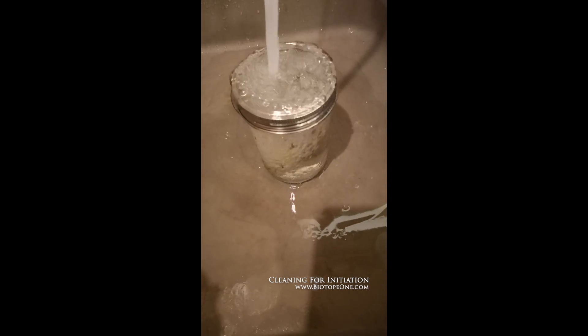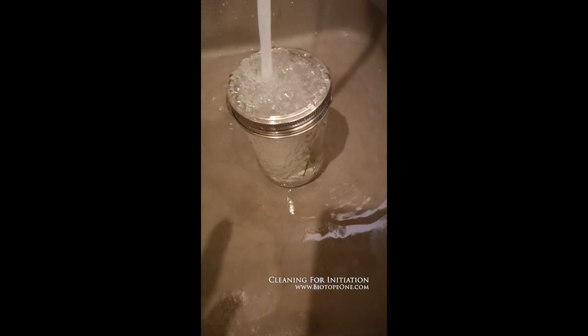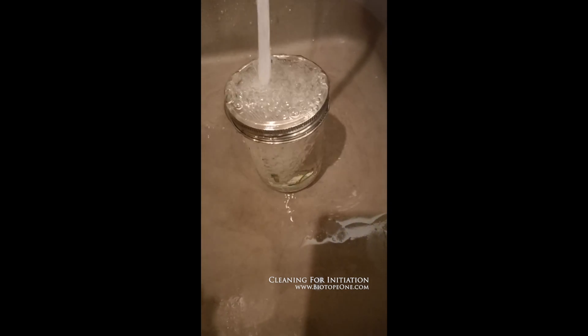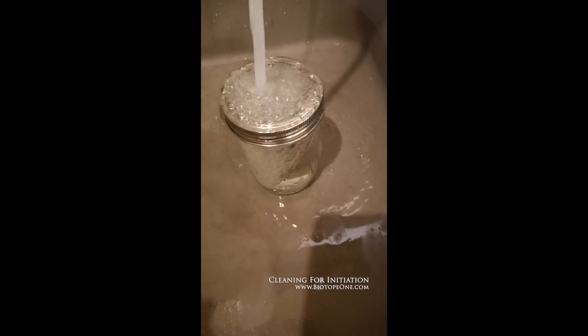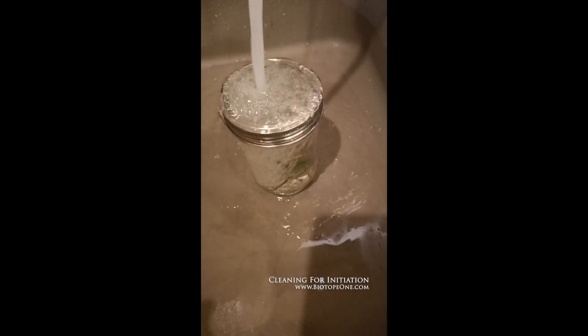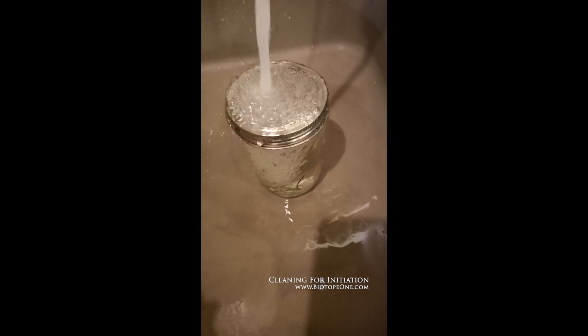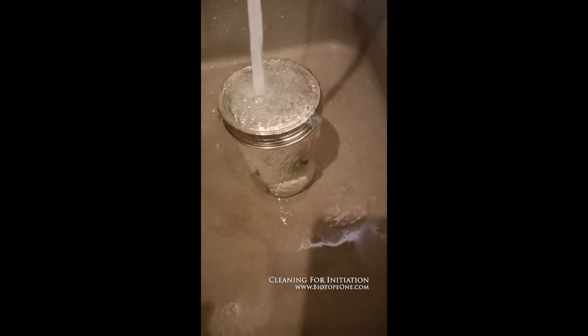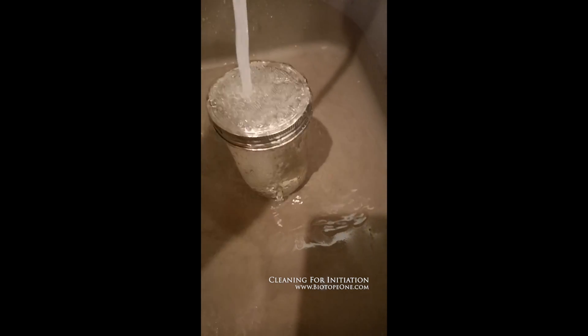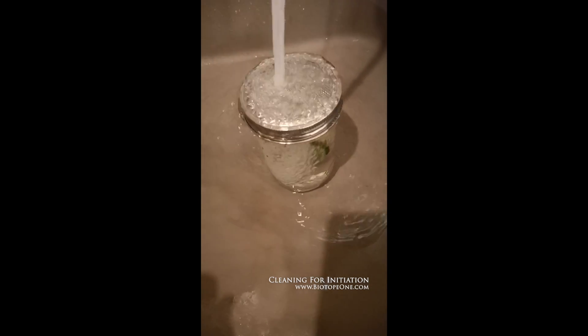Some protocols call for 20 or 30 minutes to do this agitation, though I usually don't do it that long. This material was covered up inside in the grow house, so it's going to be relatively clean. But if you get something from outside or submerged in your aquarium, you might want to rinse it a lot longer, because you're going to have a lot more contaminants — especially if it's under water and under soil.